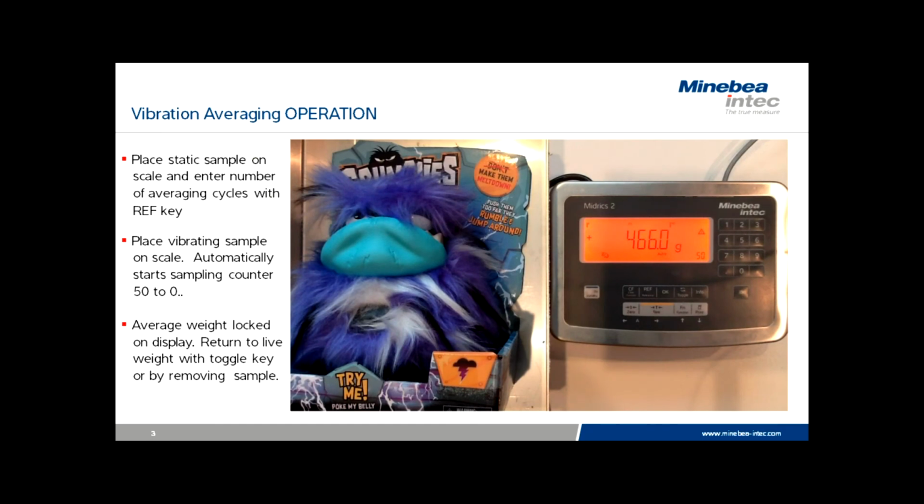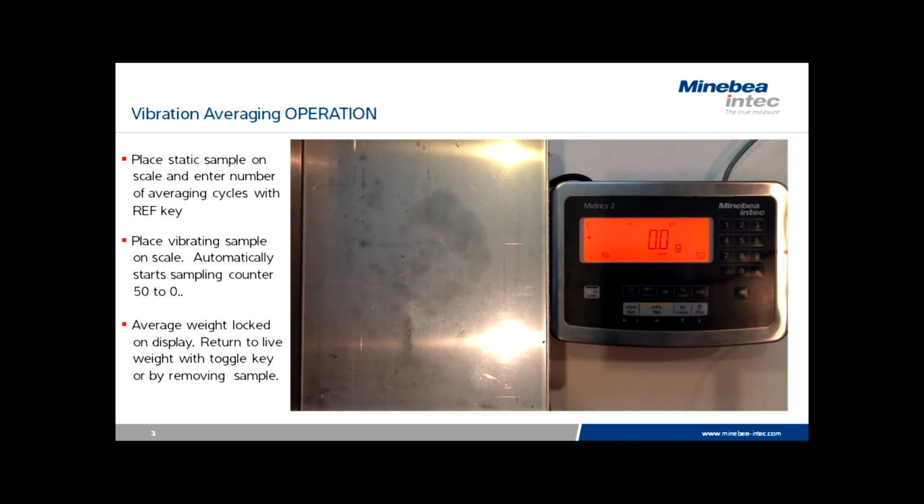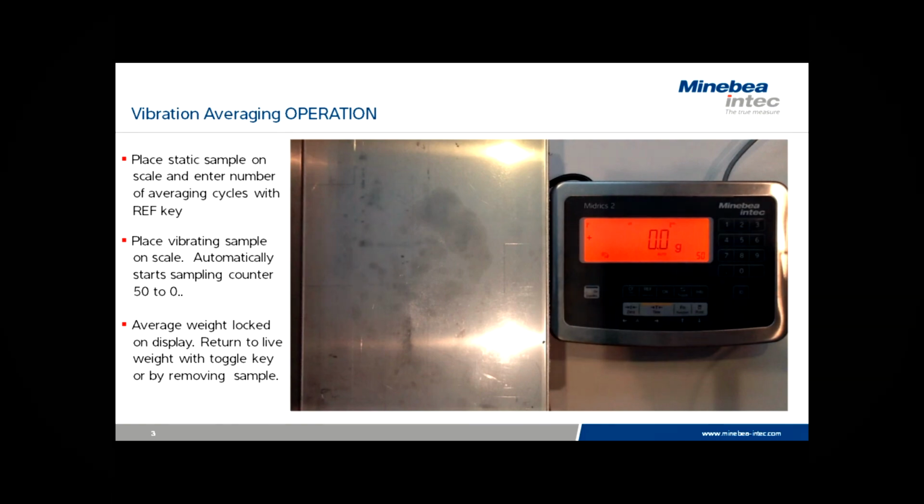So it certainly would appear that we have set everything properly and we're ready to continue with the remainder of our items. This video regarding weight averaging operation is now concluded.